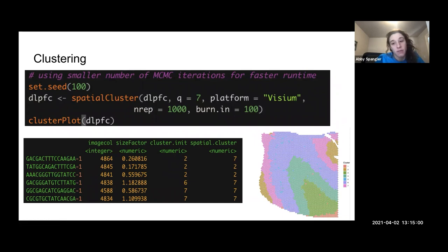So then you do the actual spatial clustering. Again, I chose the number of clusters to be seven because we already know this about the DLPFC tissue that we're working with. And it'll do initial clustering step and then it'll do the spatial clustering. So keeping in mind the different neighbors for the spots and then you plot it and here it looks pretty good. You can see this section was the white matter and then it looks like it does have sort of a layer structure to it.